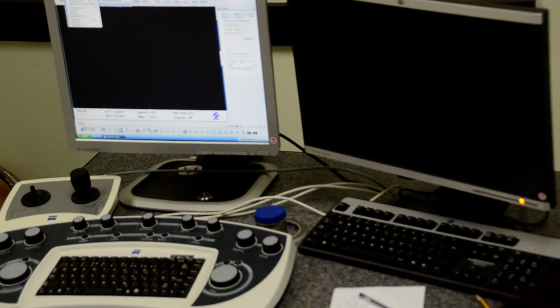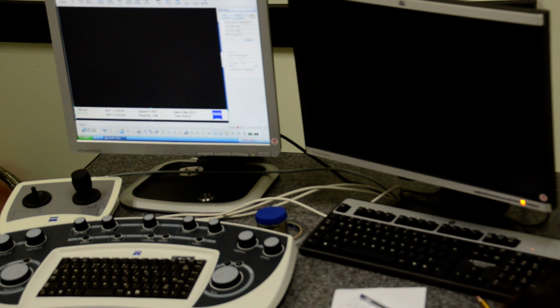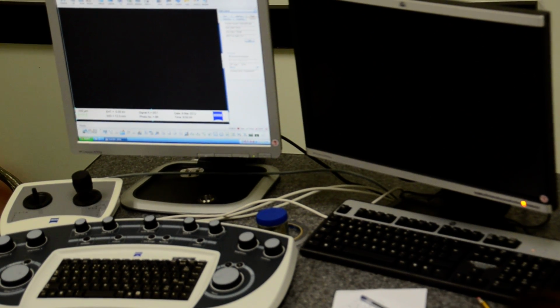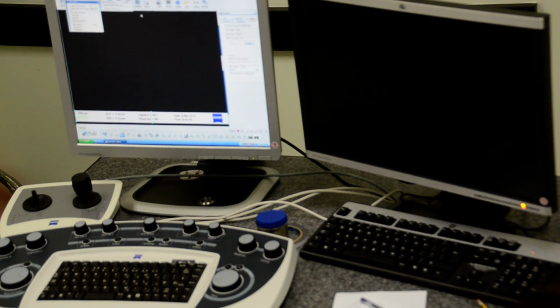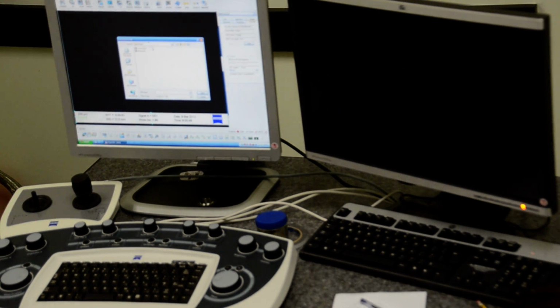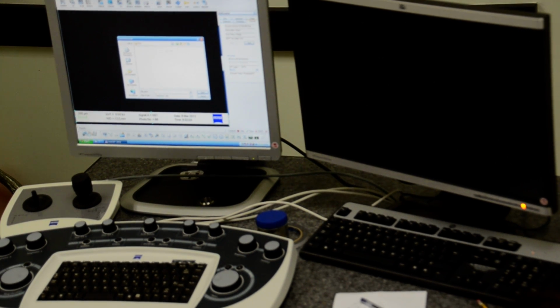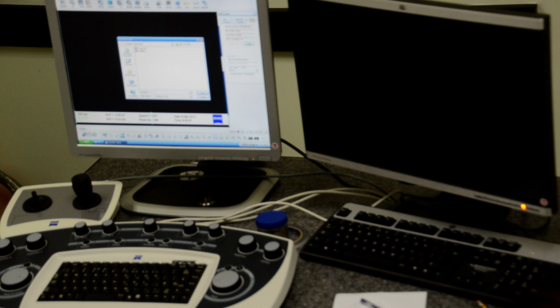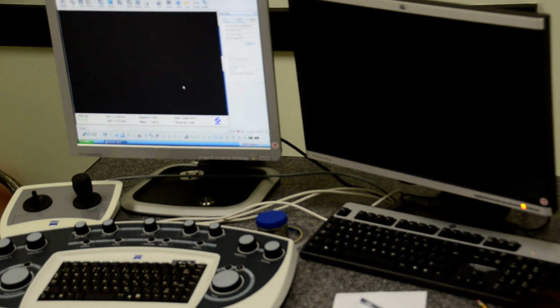Actually, you can load. You can say display default data zone. This is the default one. That's from guide. Because in case someone already messed up here, you go to the data zone, load the user data zone. It's under default. You click this one, say yes, then you will refresh back.